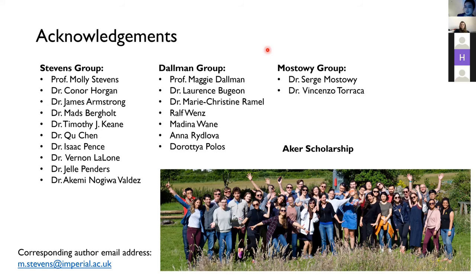I think the strength of Raman is that since you generate these biomolecular profiles which are loaded with information, you can interrogate the metabolism or changes in the metabolism in really great detail. But you need to work within that type of question.